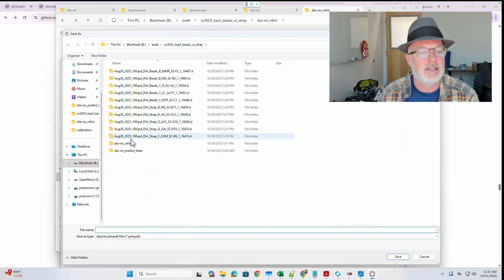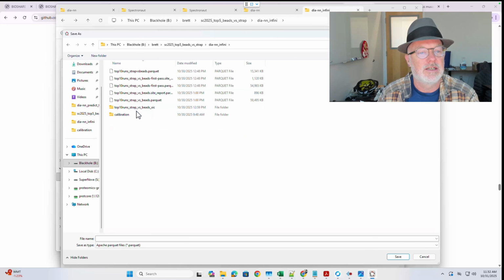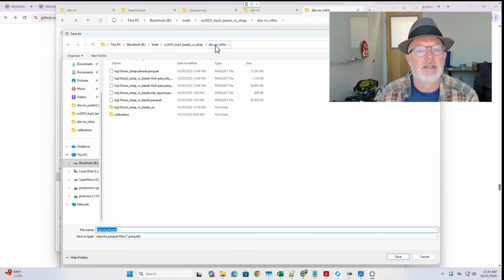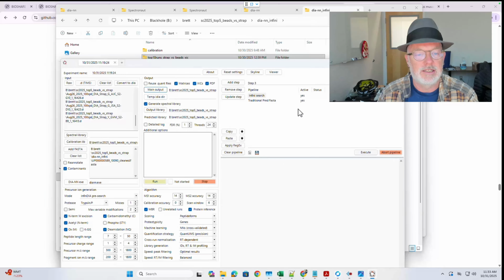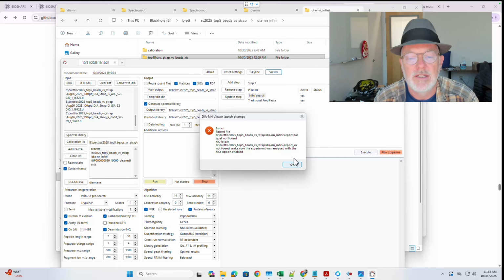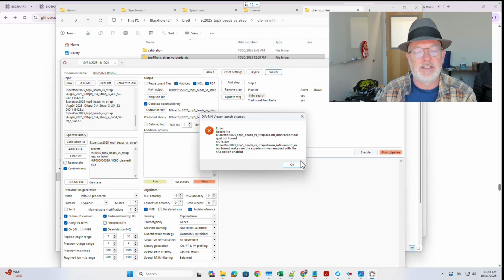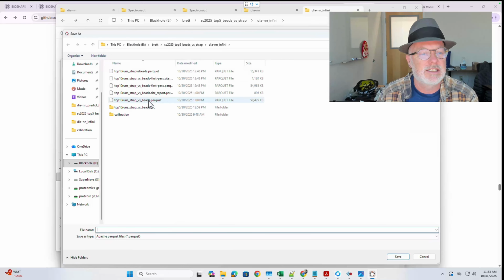I think, was that the, let's see, XIC, I believe so. If you save this, just give it a baloney name. Does that work? No, maybe you do main output. Let's see. Main output, let's try that. And then viewer, let's see, what does that say? Report XIC not found, so I have to save it as, remember, but I saved it as the last time. I think I saved it as that one. Is that right?